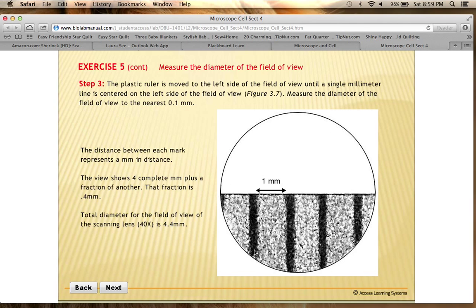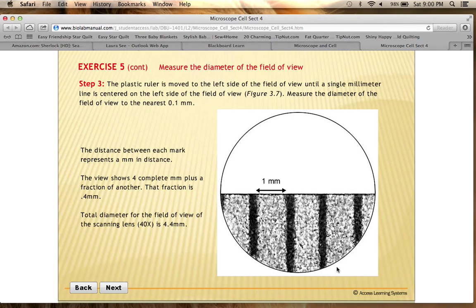The field of view is just what you can see when you look through the microscope. Using the ruler as our guideline, we've got the beginning of a tick mark here, then one millimeter, two millimeters, three millimeters, four millimeters, and then a little bit left over — that's 0.4. So the total diameter of the field of view for the scanning lens is 4.4 millimeters across.